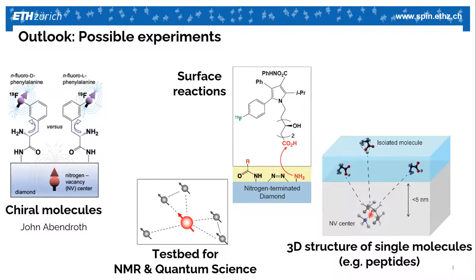But of course, there's something that puzzled me. You spoke about 2D NMR. I can see that it would be fairly easy to add another pulse in what you call the Ramsey sequence. But if you have no chemical shift dispersion, and I don't think you have enough dispersion at such low field and probably very inhomogeneous fields, what is it going to help? What is it going to tell you to do 2D? Or do you have in mind to do some heteronuclear 2D where you could maybe go from protons to carbon and back to protons or something like that?